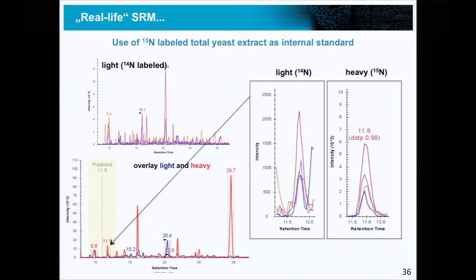All my 6 criteria are fulfilled. So now I'm confident that I'm looking at the right thing and I can do quantification with it. And without having all the 6 criteria, it would have been very vague and very difficult to do that.